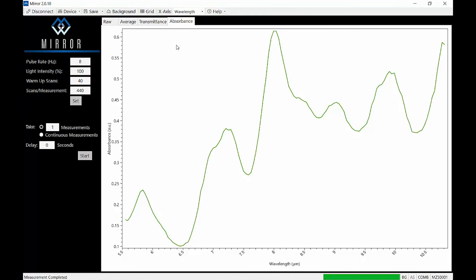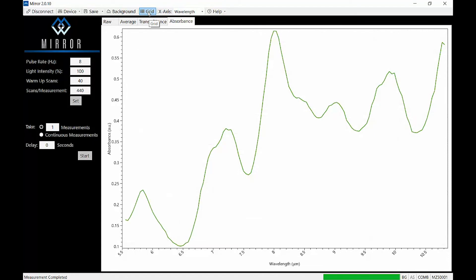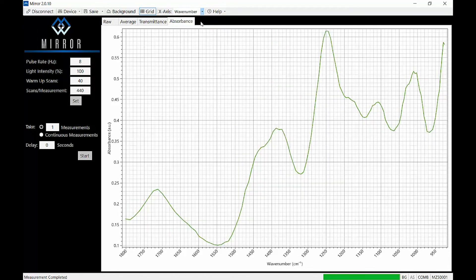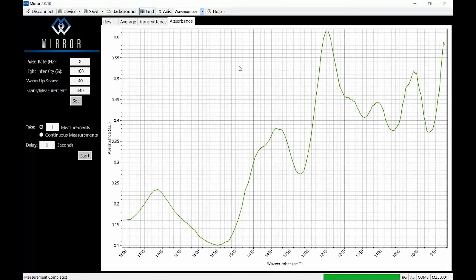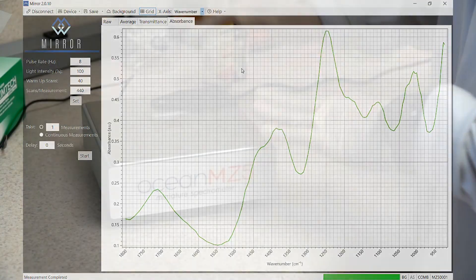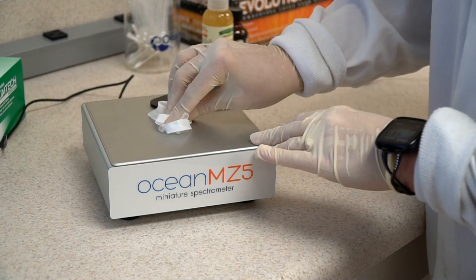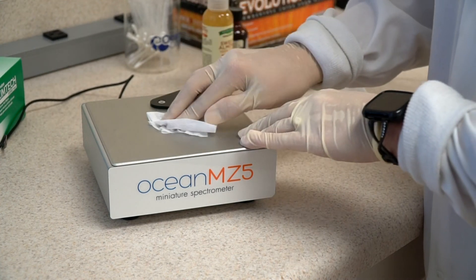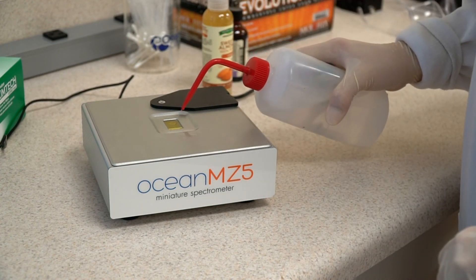Other options include toggling a grid on and off using the grid button above the graph view, or changing from wavenumber on the x-axis. When finished with your MZ5 for the day or when changing samples, remove excess liquid from the crystal and clean it with an isopropanol or methanol-soaked non-abrasive wipe. Repeat this step as necessary until the crystal is clean and streak-free.